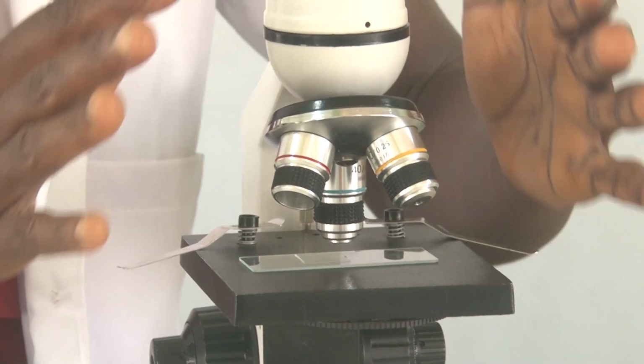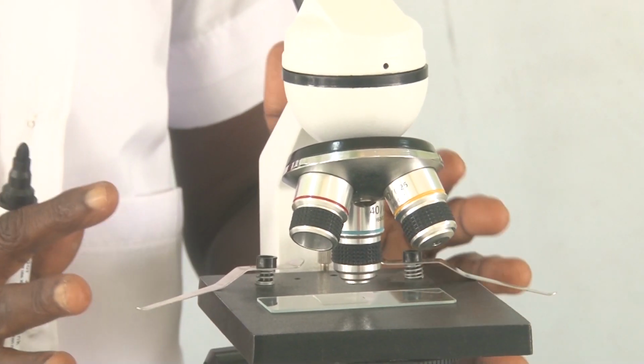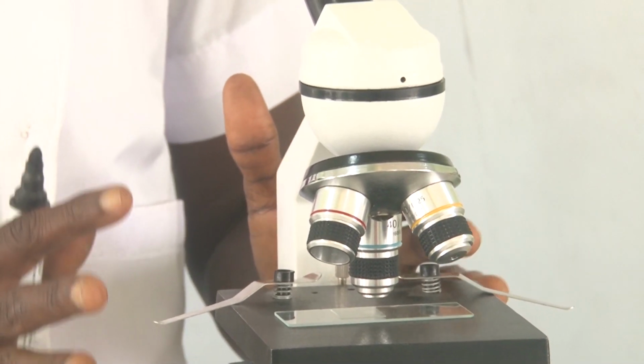So what is the build of the microscope? The parts of the microscope we are going to look at. Once you understand the build of it, you will be able to see how to use it easily. And the optical microscope uses light. That is why it's called optical. It uses light for us to see the organisms. And it doesn't only use light, it also uses convex lenses.